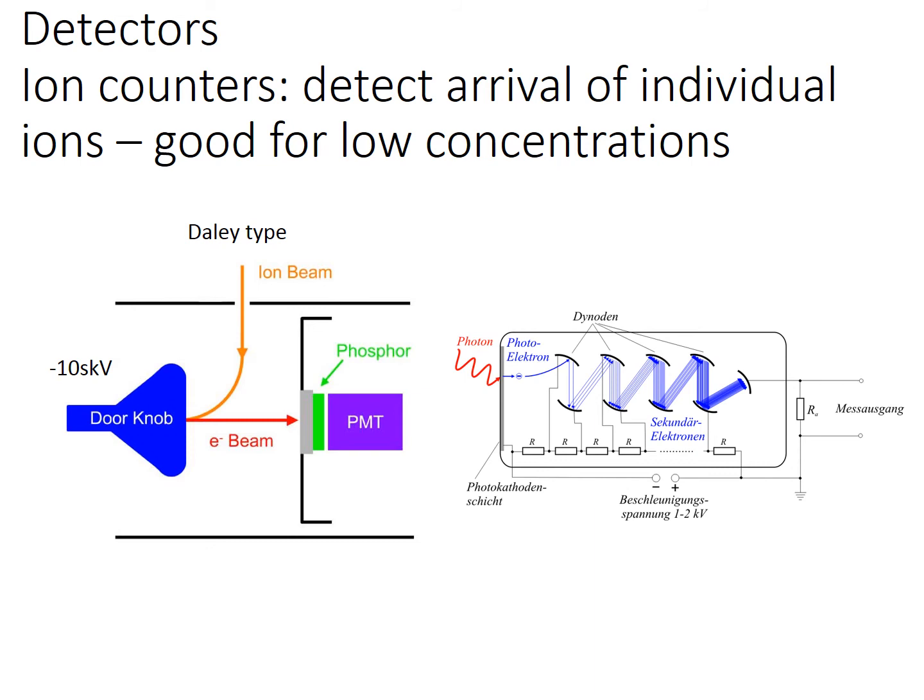And this is a similar device where an electron comes in and heats one of these. Basically, this is a metal plate coated with kind of magic paint, which no one knows what it is, but it's basically magic paint. And every time an ion hits it, it gives off a shower of electrons. It goes, oh, get off! And some of those electrons hit another plate, which gives off even more electrons. Okay, so it basically creates this cascade of electrons to create something that's big enough that we can measure as a pulse of current coming at the end.